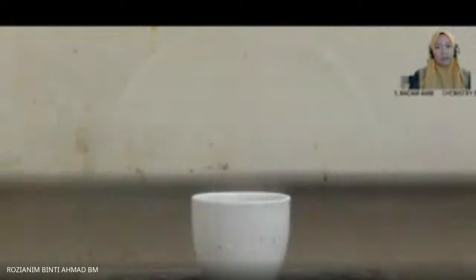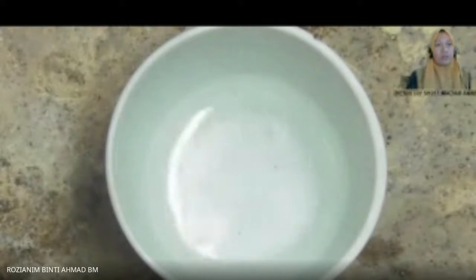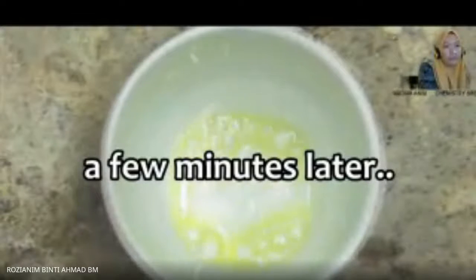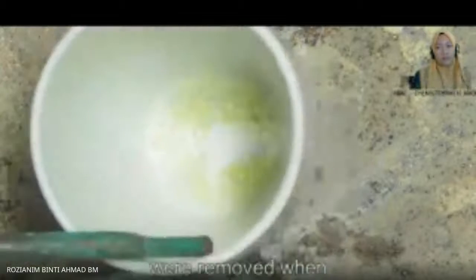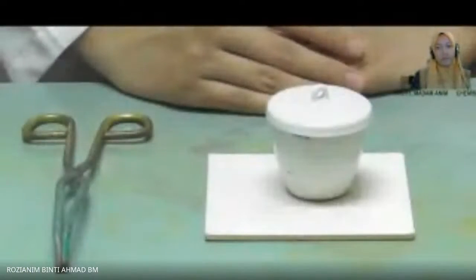Can you name the substances removed from the mixture during the heating process? It looks like the mixture is dry. Excess hydrogen chloride and water were removed when the mixture was heated. Handle the crucible with care. Use the white tile to support the crucible and prevent it from slipping.